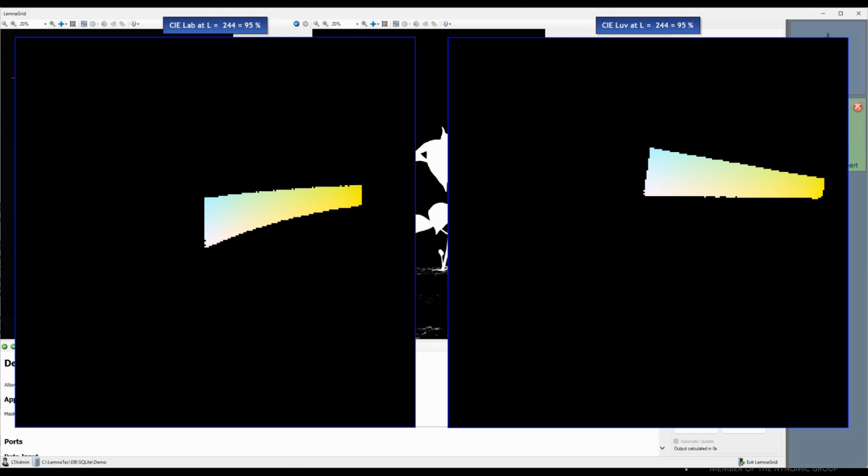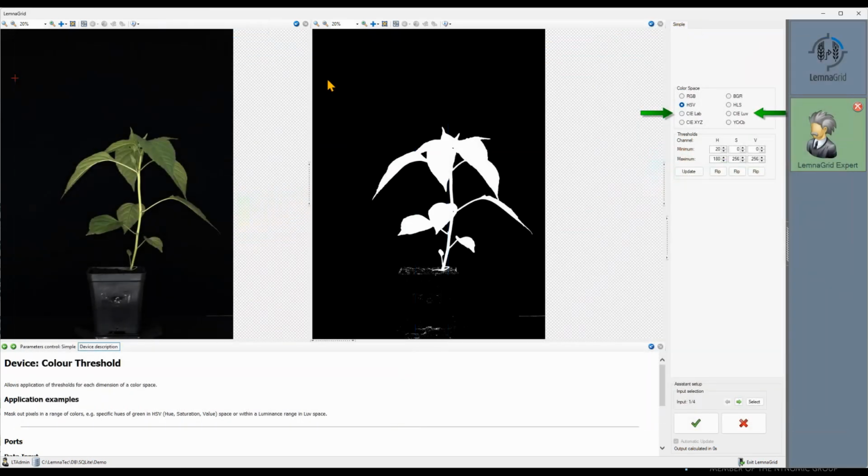You see that not all values which are technically possible for A, B, and U and V are actually used in these color spaces. The best way to use them is to color pick the required colors in the image and modify the border manually until you get the desired result. Let's try the LAB color space first. We focus here on adjusting A and B. But first, we have to reset the L component.